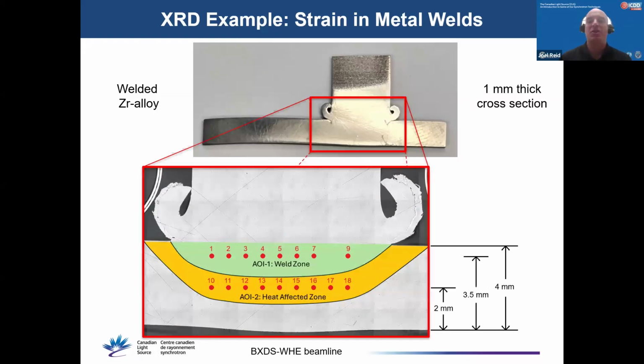So the client was interested in what is going on in the weld region where the two pieces join here and the heat affected zone that's adjacent to the weld region.